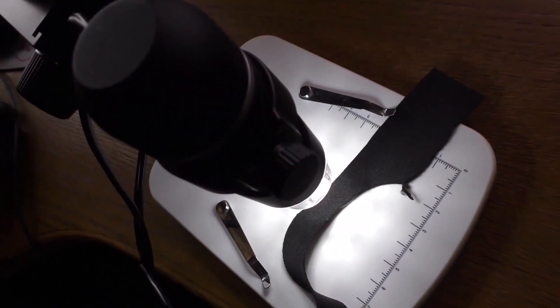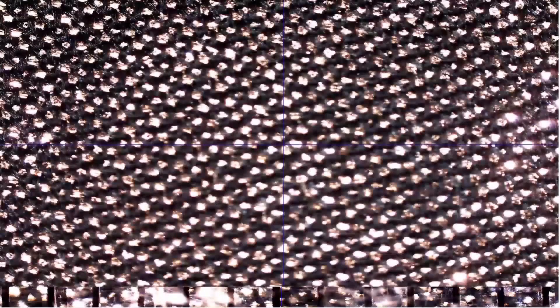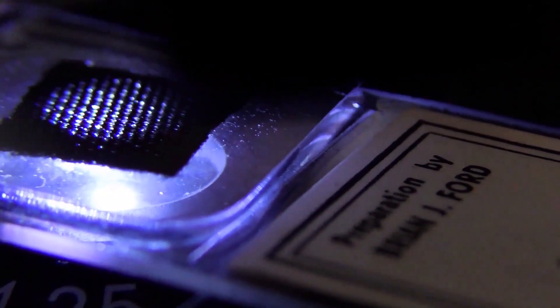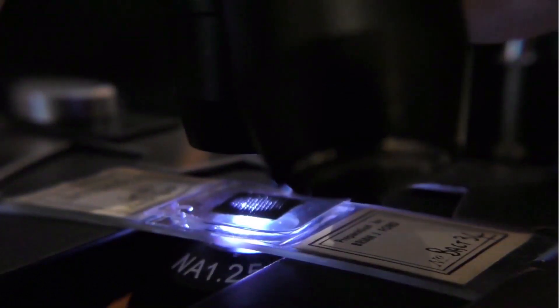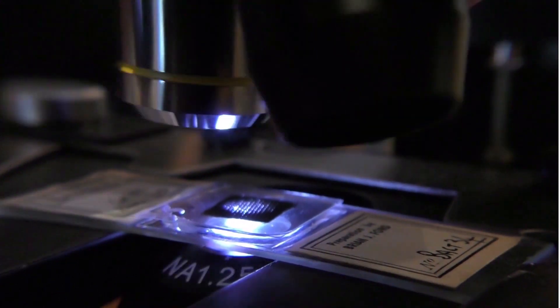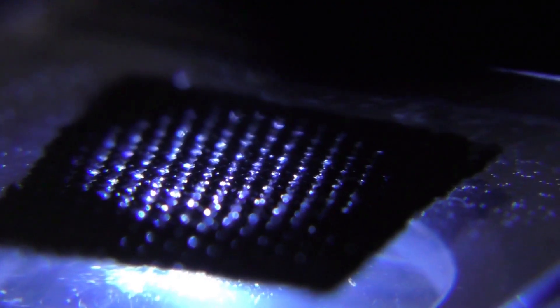This is how it appears under the low-power digital microscope. Each hole is a quarter of a millimeter across. Now we'll mount a portion on the prepared slide for examination with the research microscope. Magnified about 50 times, we can see the structure of the mask.